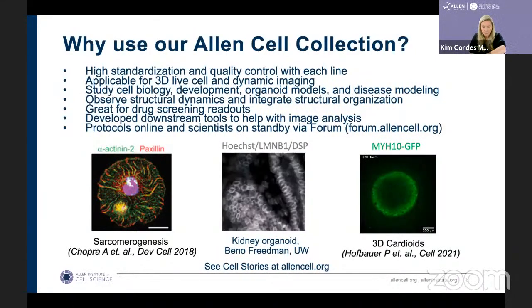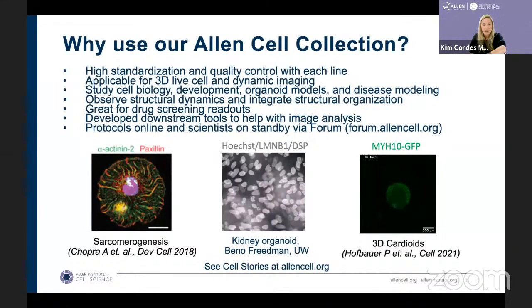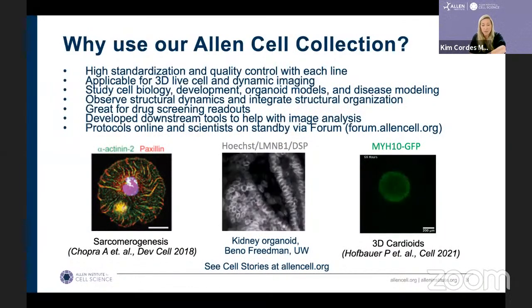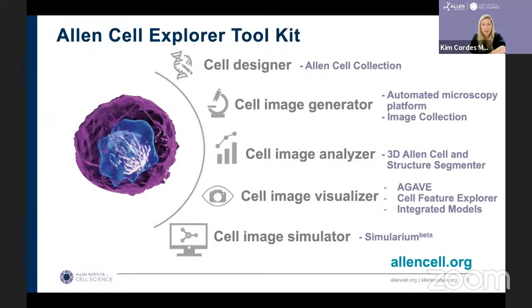So as I mentioned, we have developed downstream tools to help with image analysis. We've created the Allen Cell Explorer Toolkit. This is an emerging suite of tools and workflows that allow for visualization and interrogation and modeling of different cell behaviors in 3D. And so I've listed these resources here, which are also available on our website.